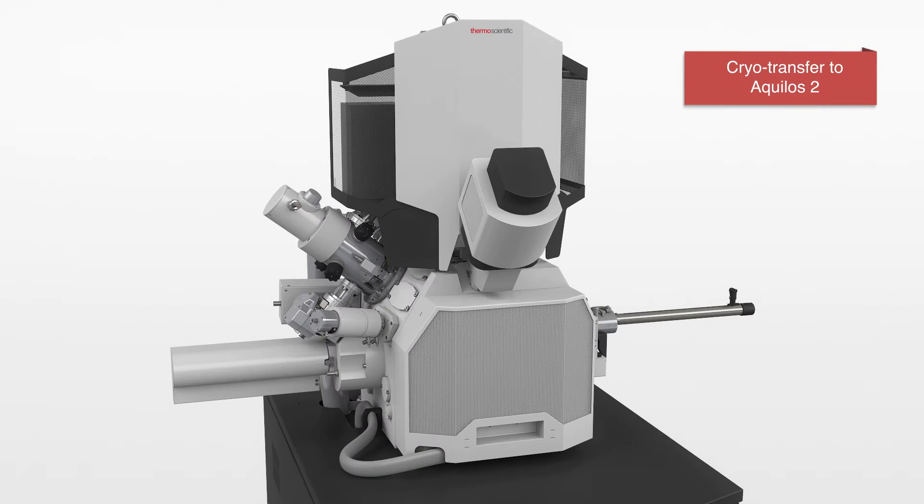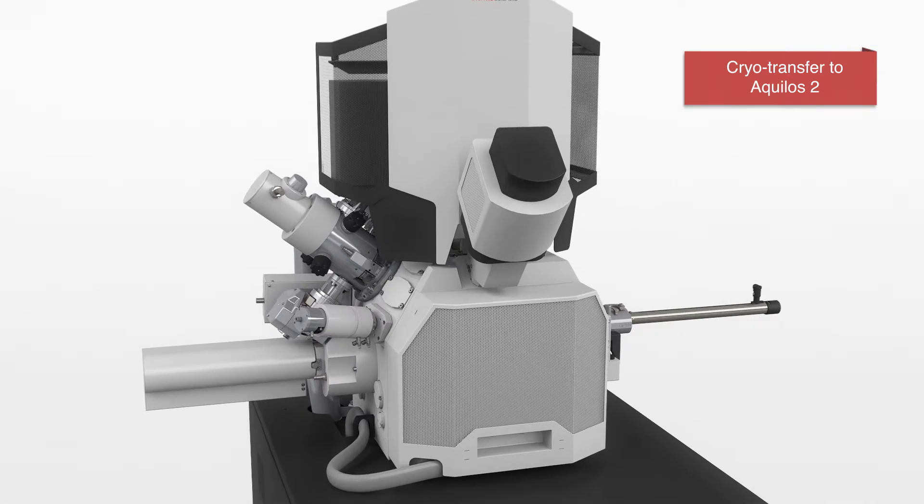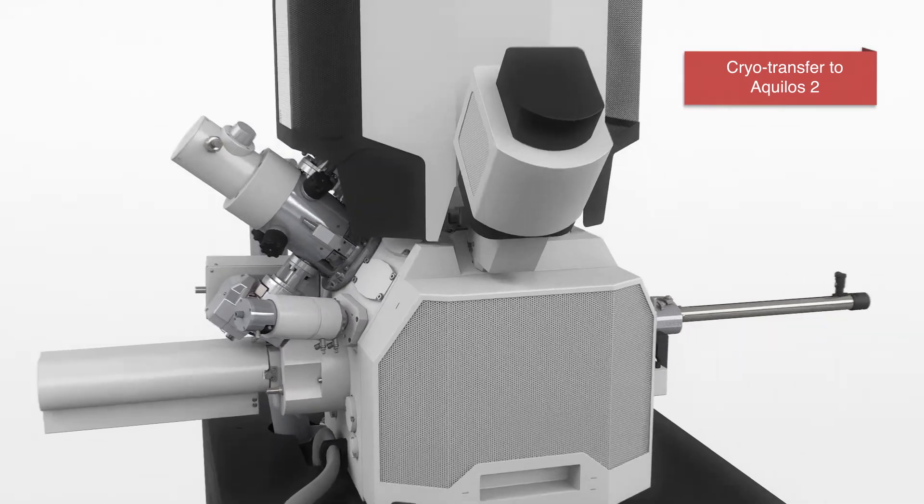The Aquilos cryo-FIB is a dedicated cryo dual beam microscope. This instrument is used to produce thin electron transparent samples from the cells, which can be imaged later by cryotomography in the Krios.